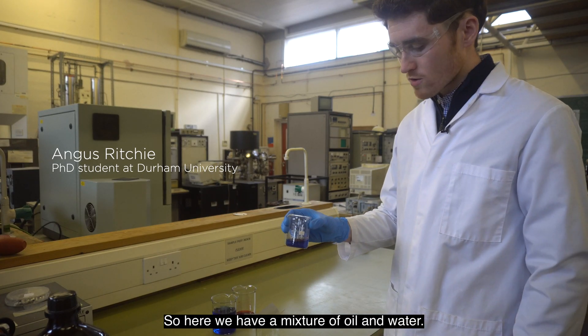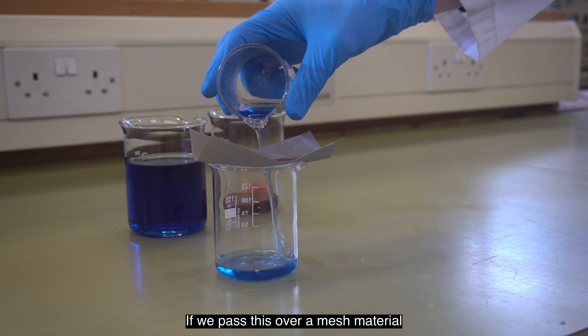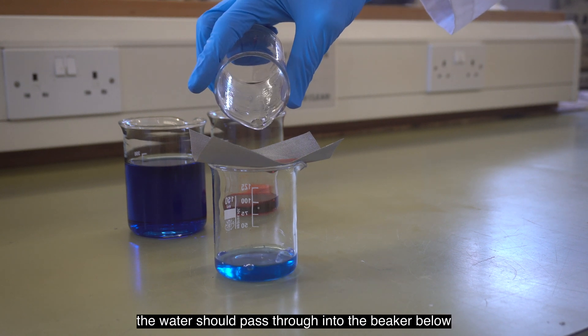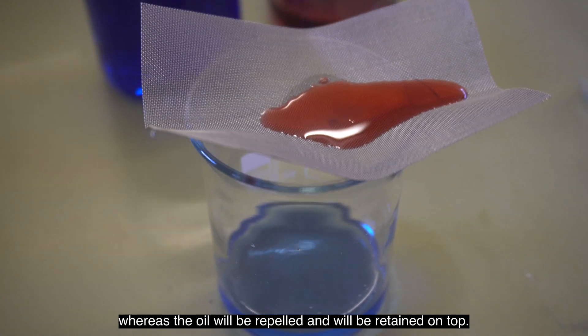So here we have a mixture of oil and water. The oil has been dyed red and the water has been dyed blue. If we pass this over a mesh material which has been applied with the coating, the water should pass through into the beaker below, whereas the oil will be repelled and will be retained on top.